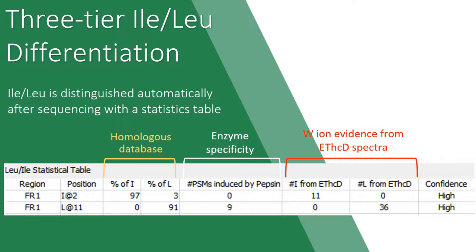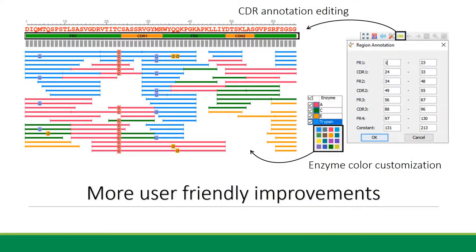We also added a region column to help users clearly see whether the IL residues are in either framework, CDR, or constant regions. To make the software more user-friendly, PICS-AB 2.0 allows users to change the region annotation positions and select different colors for enzymes if default settings are not optimal.